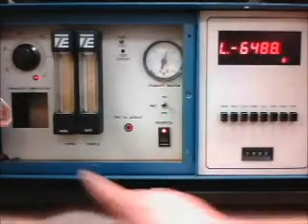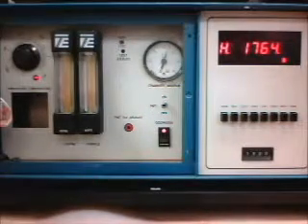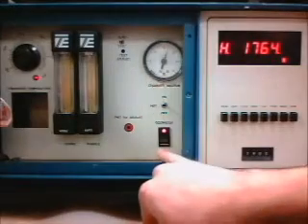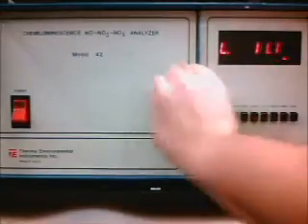We have flow through both the ozone and the sample lines. Right now it's set to run mode, and the ozonator and PMT are both on. So I'll close this up.